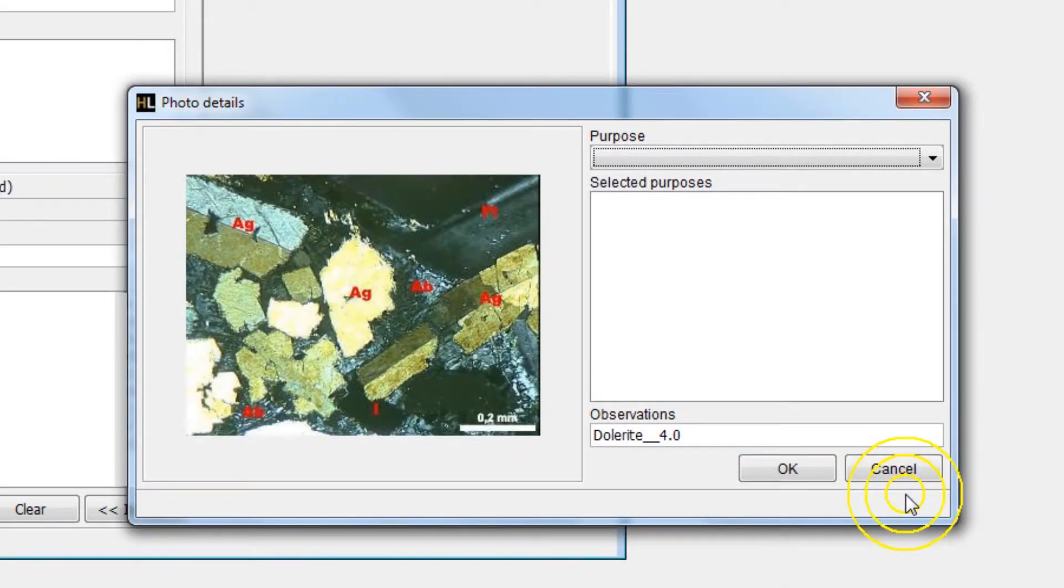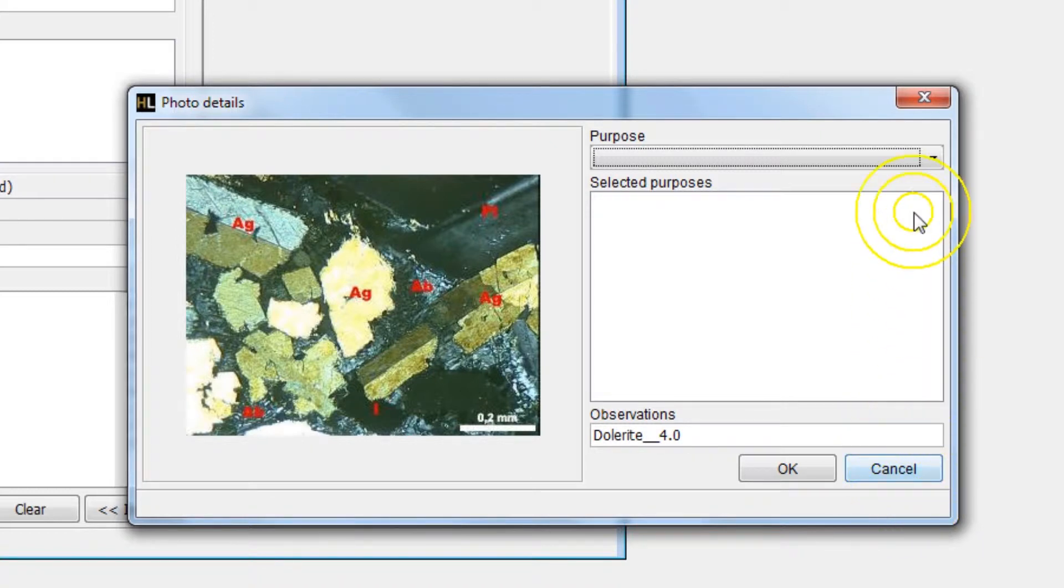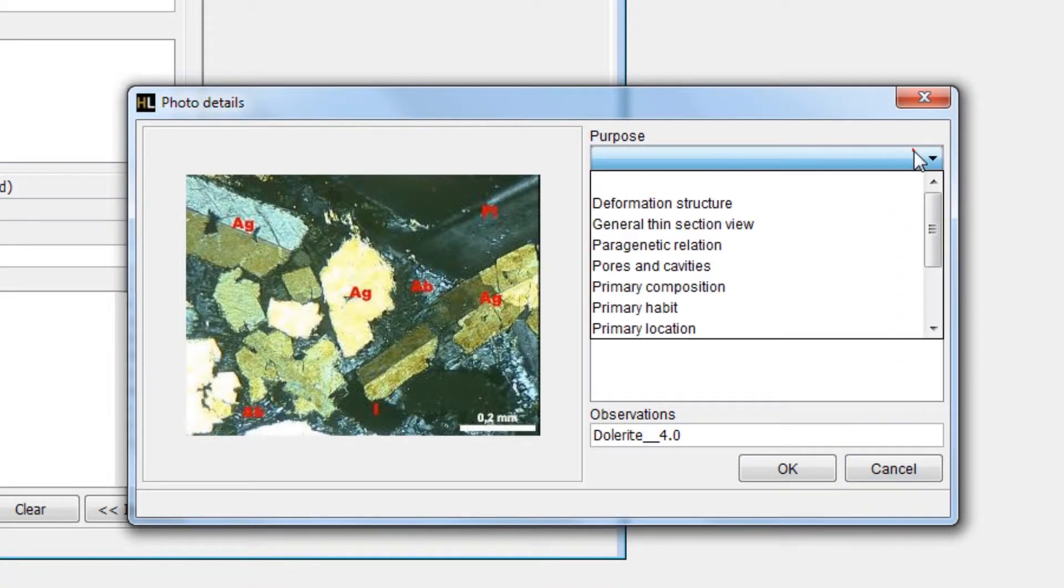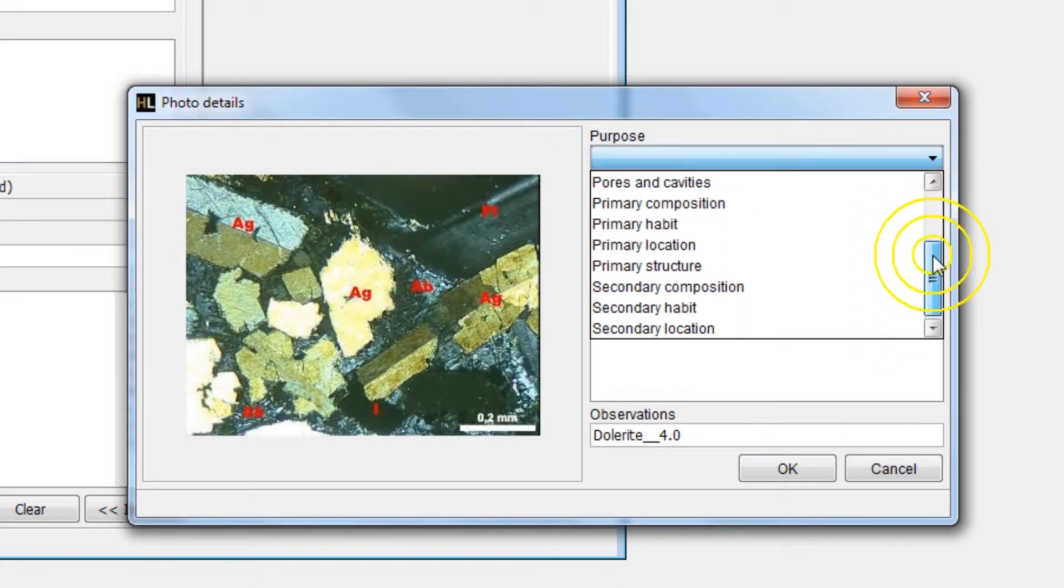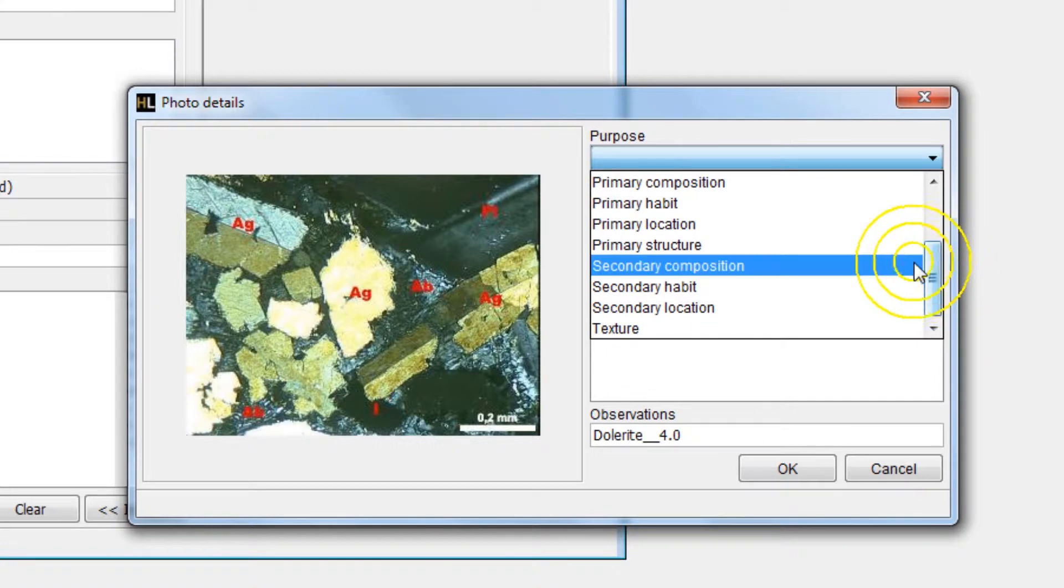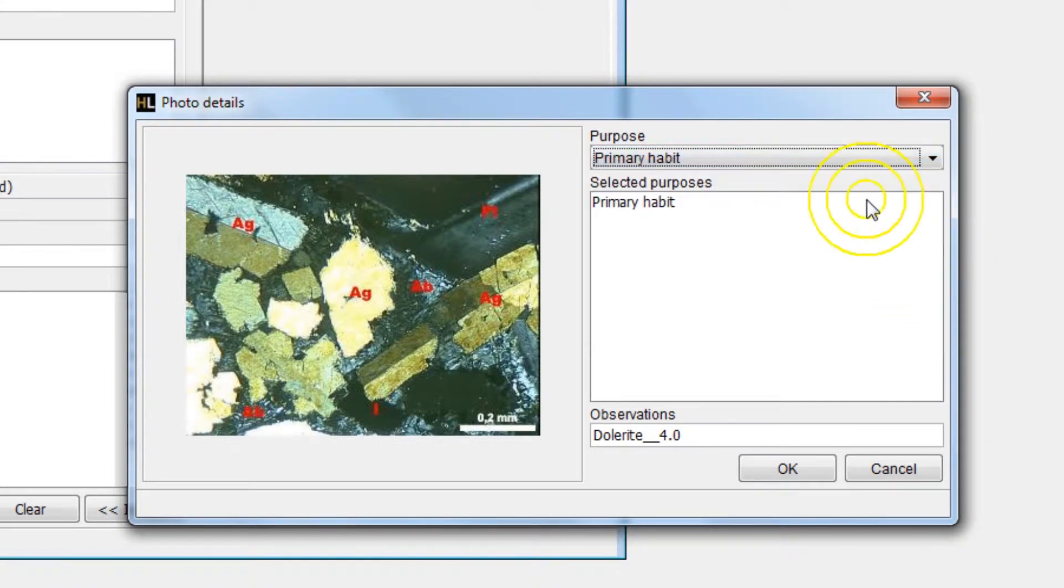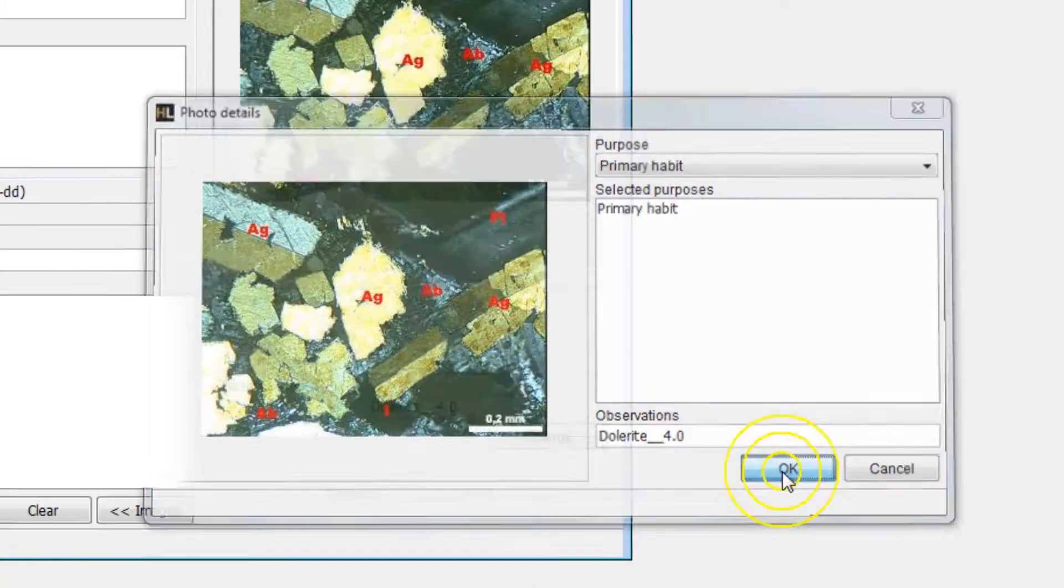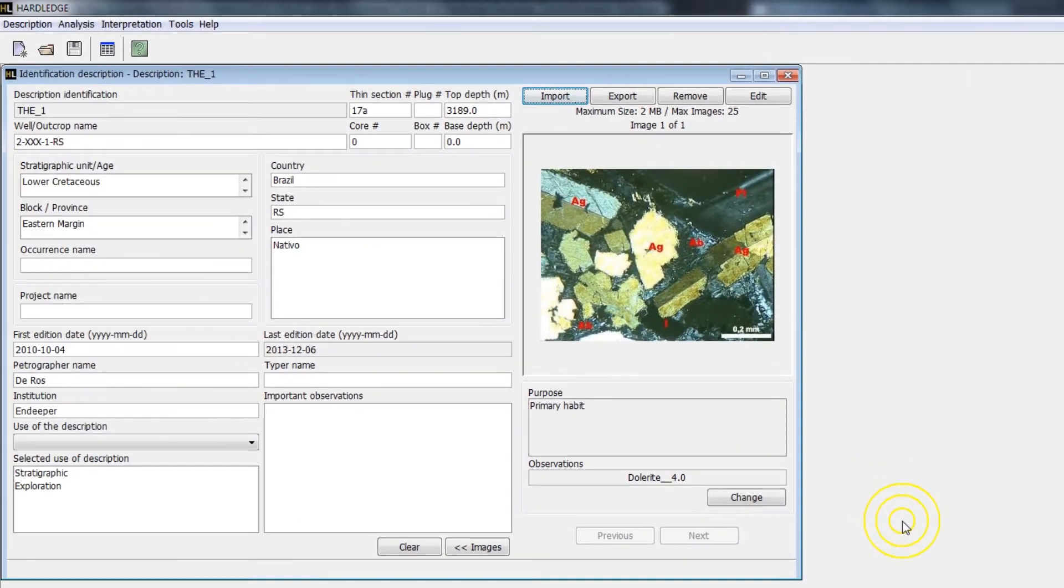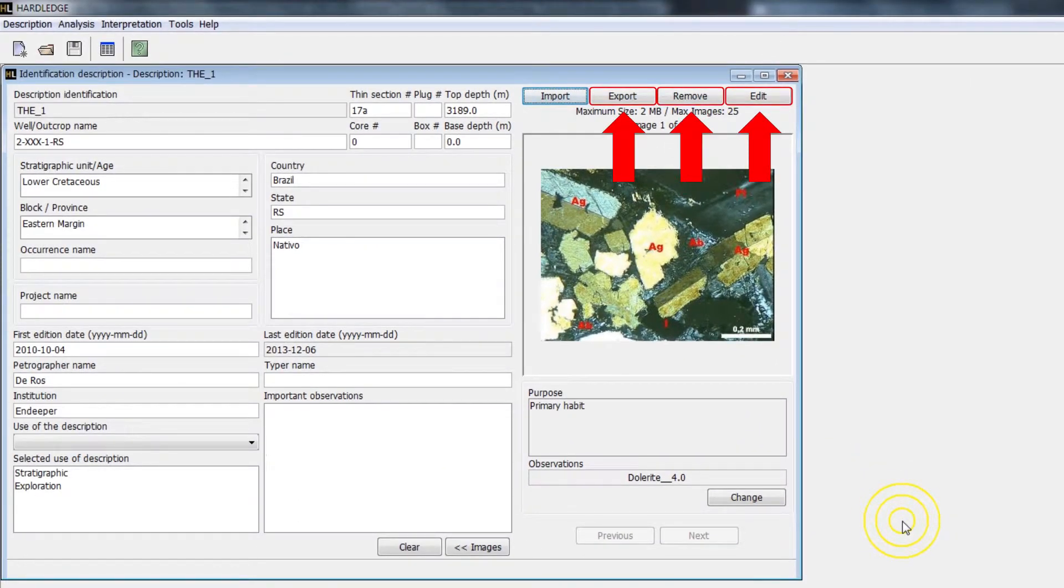A window will open where you need to define the purpose of the photo. You can add multiple purposes. Click OK. The imported image can be exported, removed, or edited.